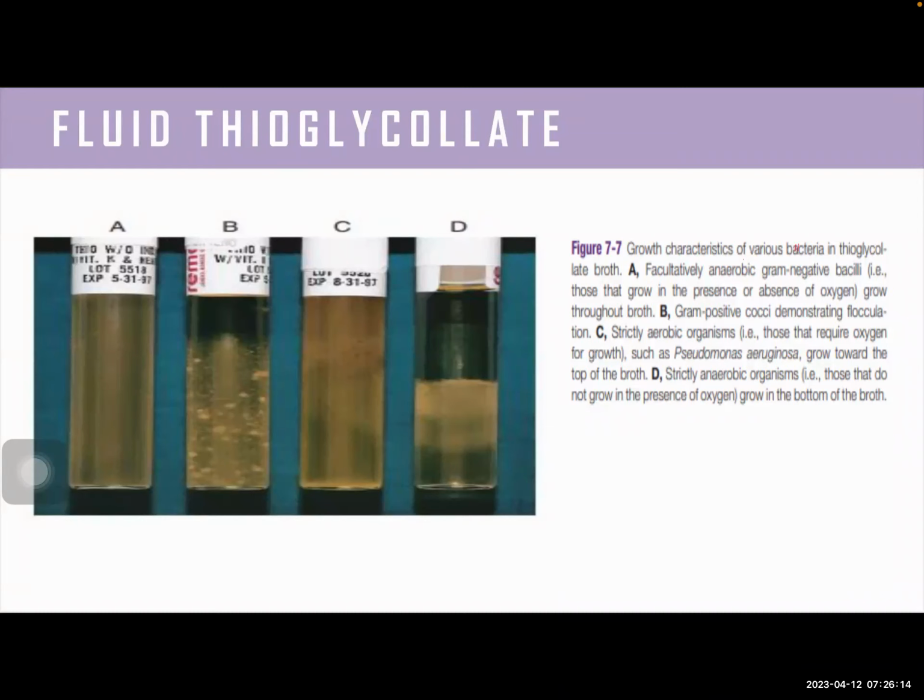And yung point lang na yun, yung pwede natin makita. But if it goes beyond or it goes below that specific threshold, hindi na natin siya makikita using our naked eye. But there is still bacterial growth on that. Therefore, to prevent any mistakes, i-boil muna natin yung mga broth natin before we use it for inoculation.